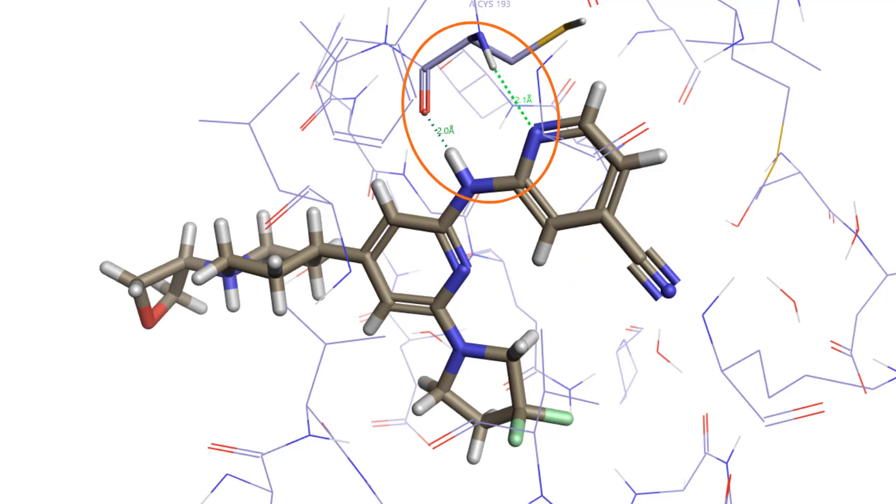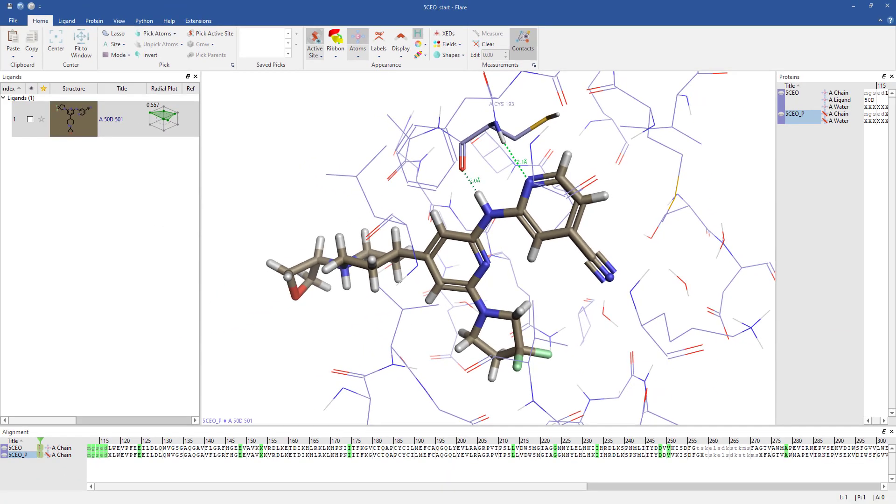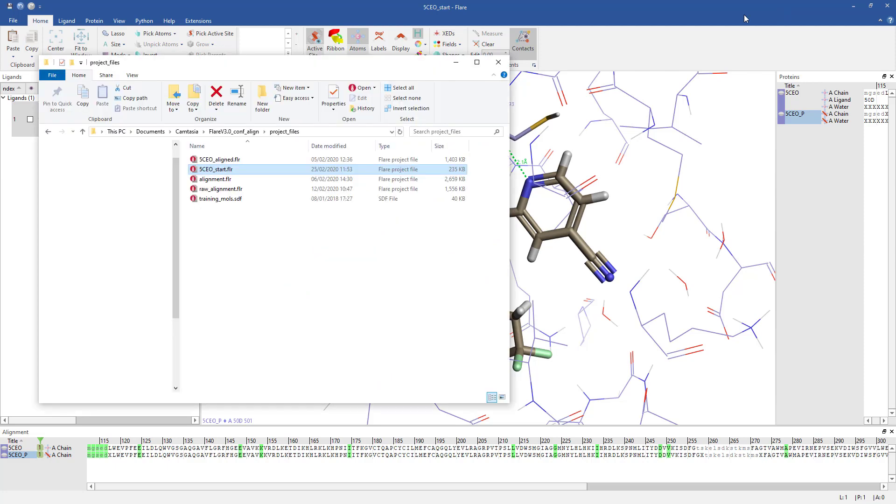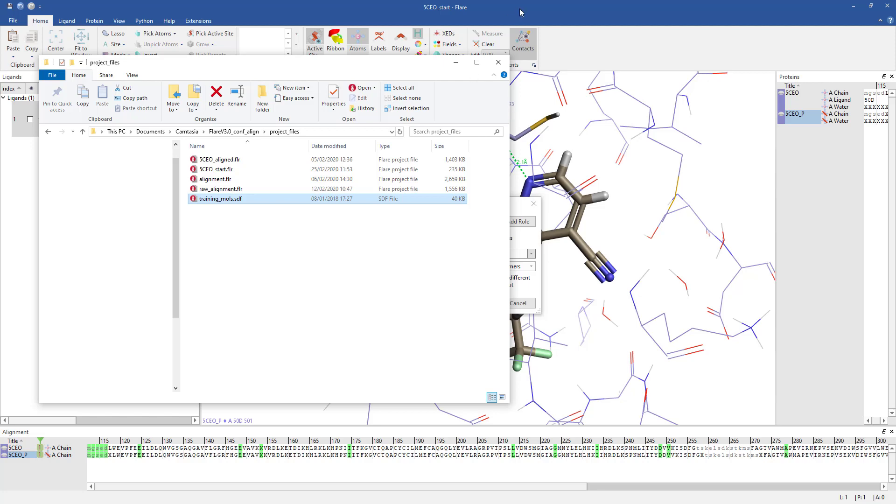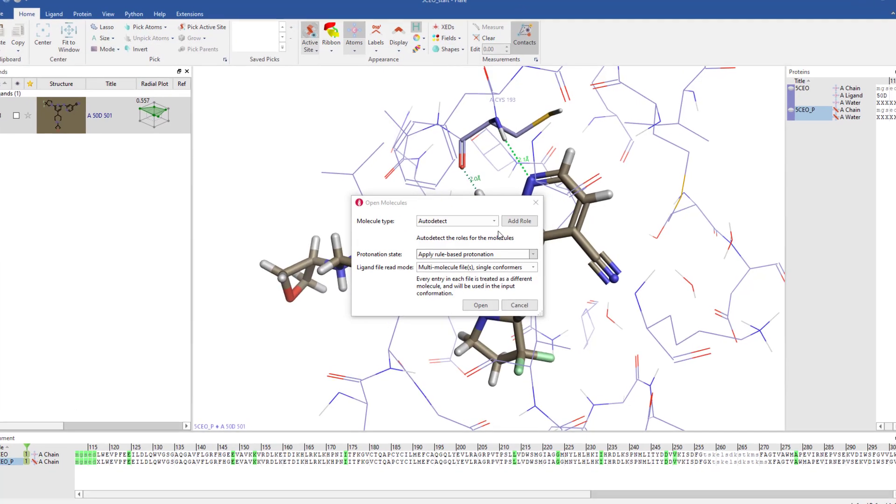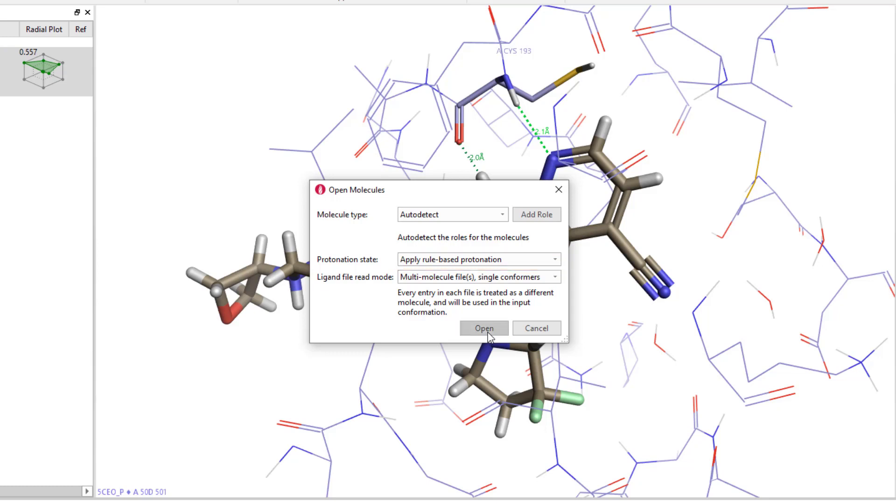I have a set of six DLK inhibitors for which I have activity data that I will align using the 5CEO ligand as a reference molecule. Firstly, I will read in the file containing the DLK inhibitors by dragging and dropping it onto the Flare GUI. I'll instruct Flare to protonate the ligands, then click Open to load the file.